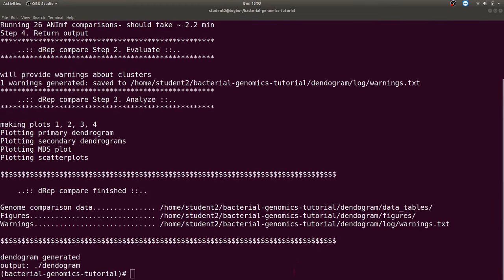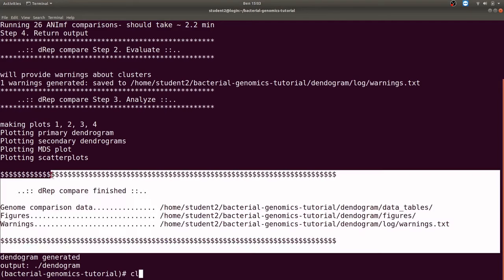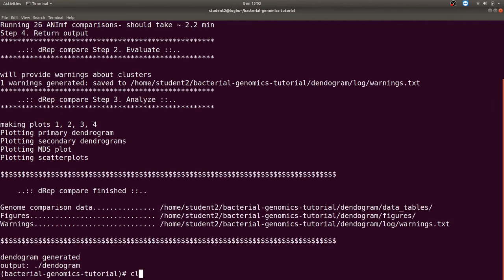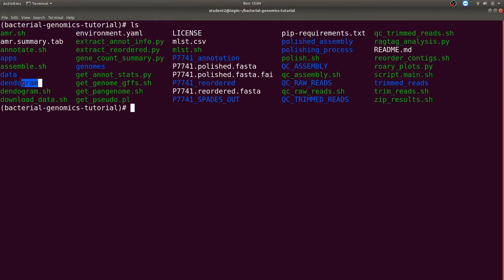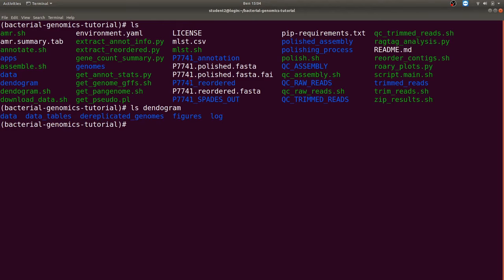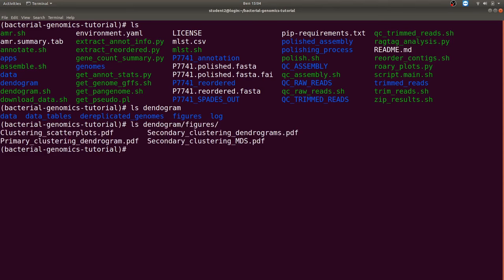DREP will generate dendrograms using the average nucleotide identity of the genomes. It uses MASH clustering and ANI algorithms to generate the dendrograms. The dendrogram has been generated and will be found in a directory called 'dendrogram'. We'll be discussing the primary clustering and the secondary clustering from these results in a later section.